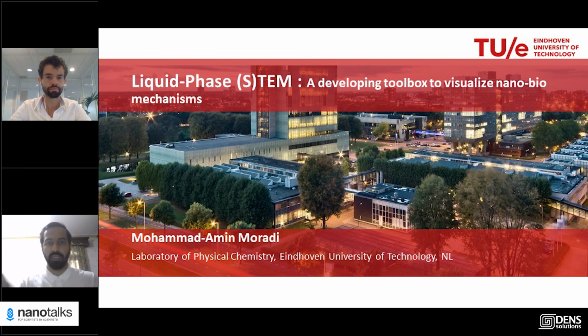So the electrons make less damage compared to cryo conditions, at least. But depending on the amount of water, and the thickness of the graphene layers you use on top or the bottom of your sample, you need to optimize the beaming procedure.